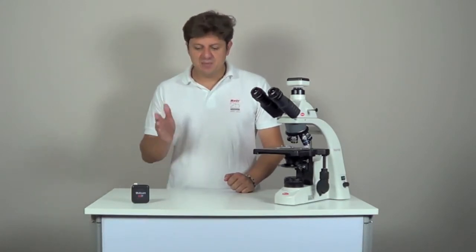Maticam 3 is the optimal performance camera with a considerable resolution of 3 megapixels, a big image sensor of half an inch and a very fast response time. It is the perfect choice for any professional user, laboratories, universities or students. It is the model we recommend for its great performance in many fields of application.